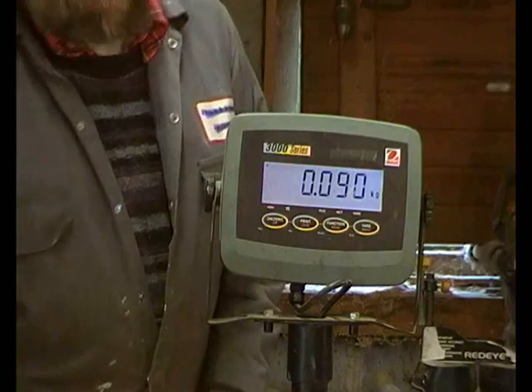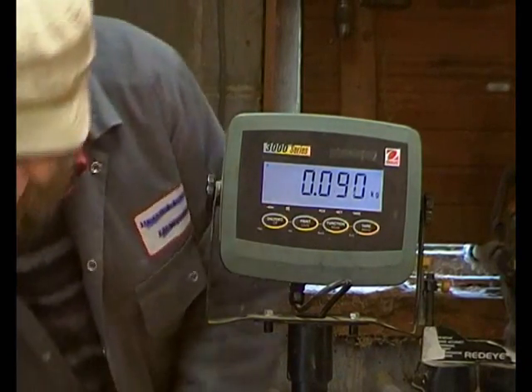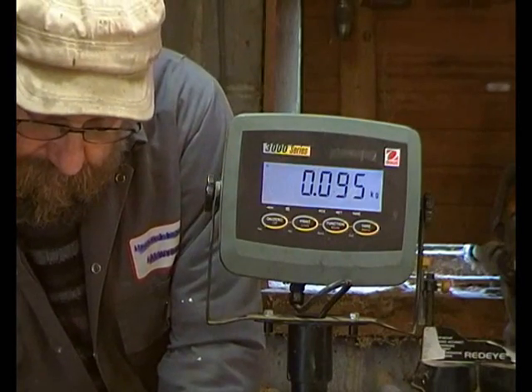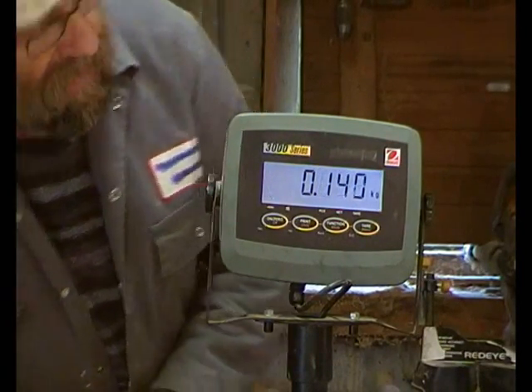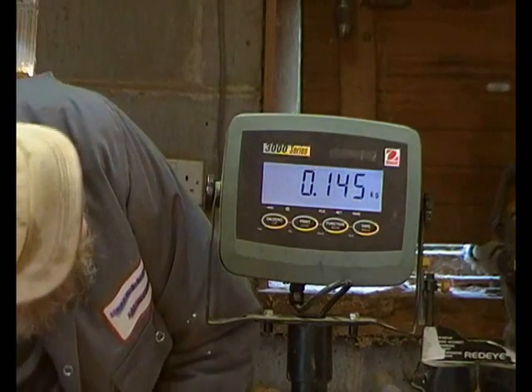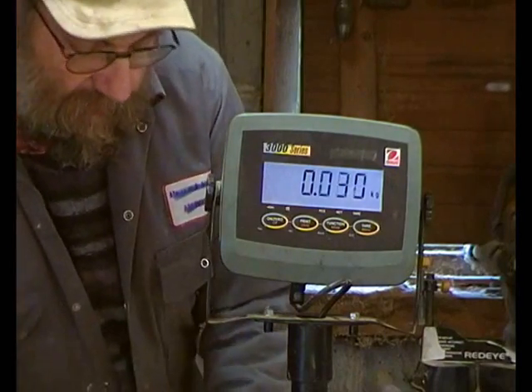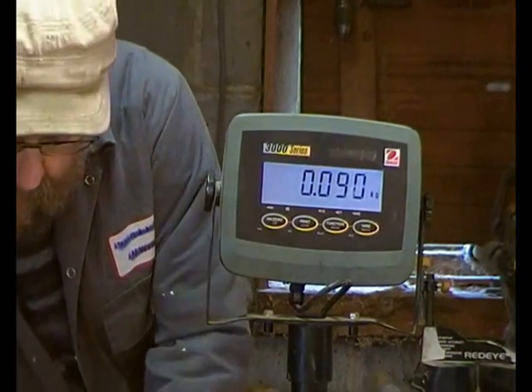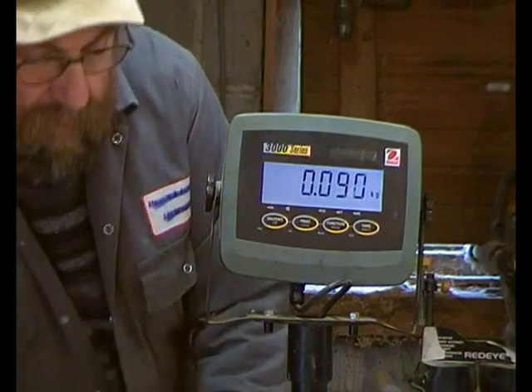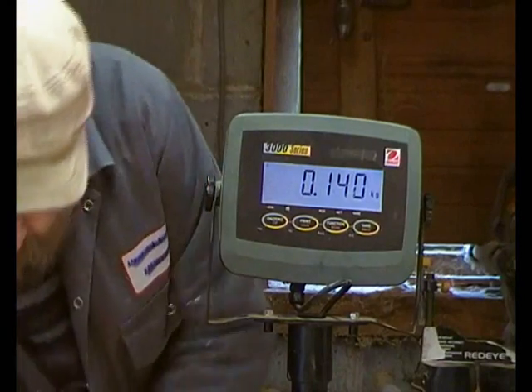Sweet chestnut — what does that weigh? 90 grams. The ash: 145. Scots pine: 95. And the birch: 140.